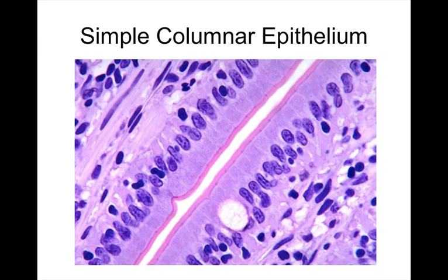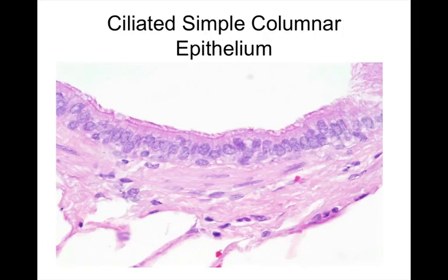This is nicer because I like the fuchsia as opposed to the regular purple cytosol. I think it made sense what you said in lab, that the microvilli appear as though you took a Sharpie and drew right over the top of the surface. What a good example. All right, so let's see. Okay, ciliated simple columnar tissue.